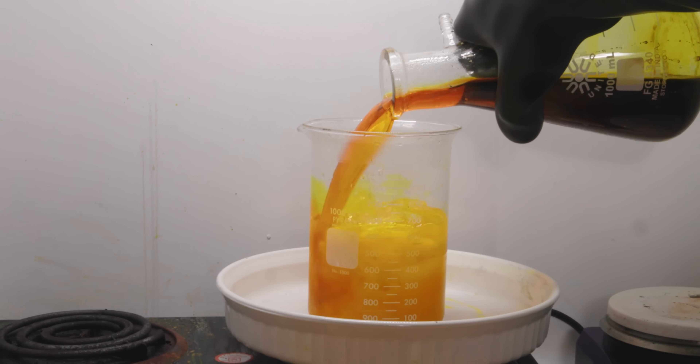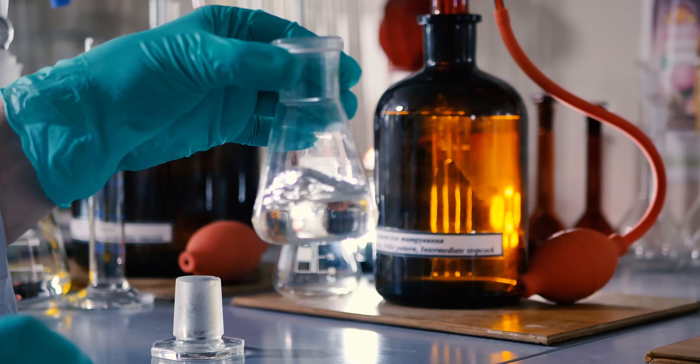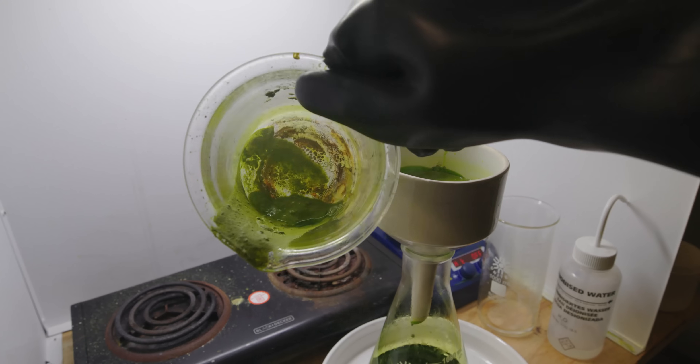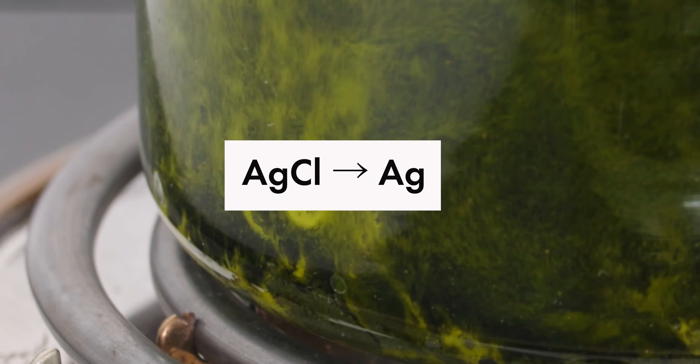In my last video, I extracted 24 karat pure gold from a blob. In this episode, we turn our attention to silver. When refining the blob, I was left with a lot of silver chloride. The mission for this video: convert that silver chloride into pure silver.